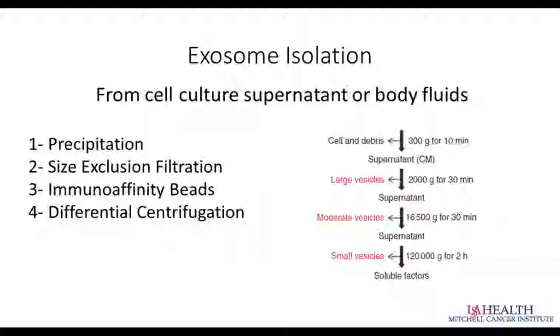I can't do too many because most of the centrifuges only have 6 tubes in them, so you can only process 6 things at once. So it is time-consuming, but in our hands, this provides probably the most pure product that we can work with, especially when we're looking at doing flow cytometry where they're not left with any kind of sticky coating, and we don't get too much non-specific antibody binding.